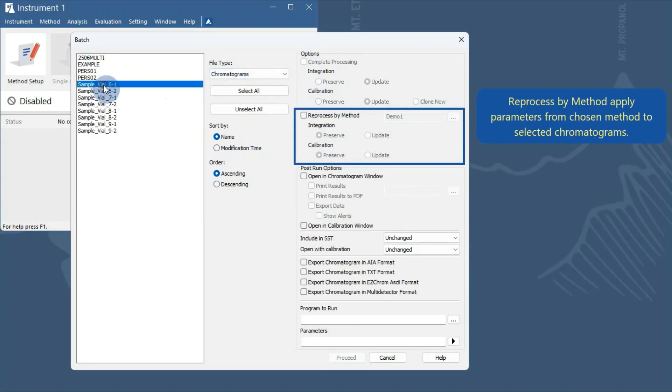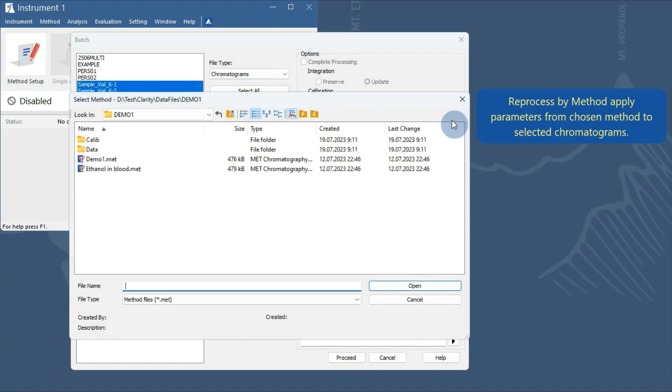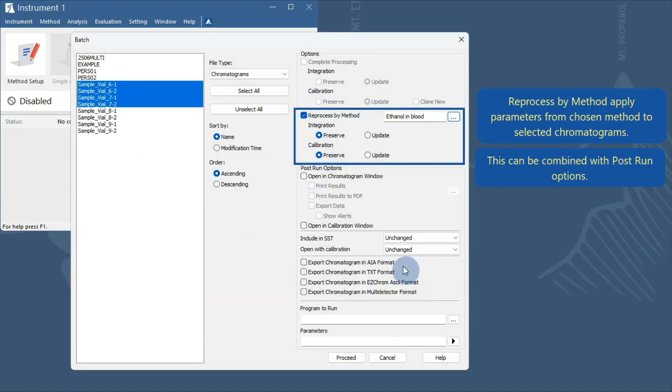Reprocess by method applies parameters from the method to selected chromatograms. This can be combined with post-run options.